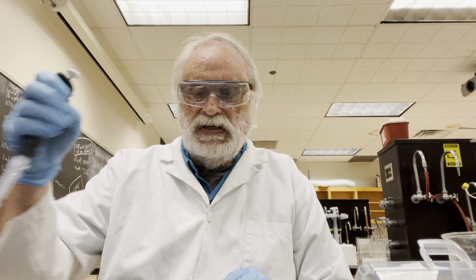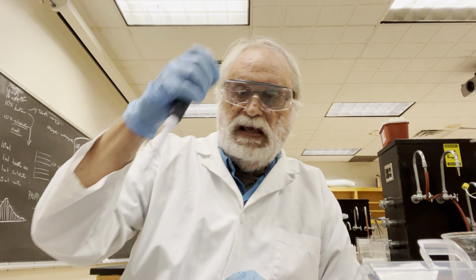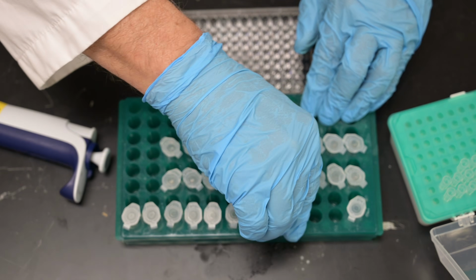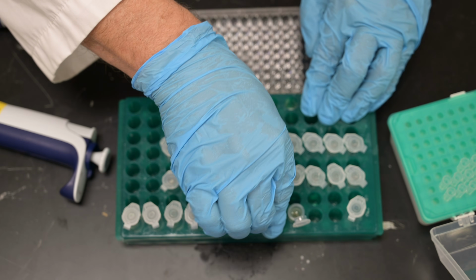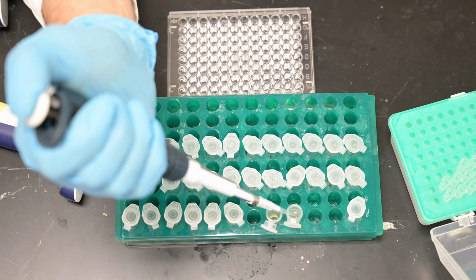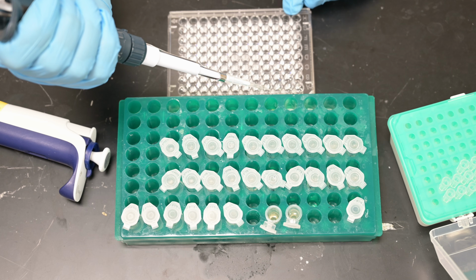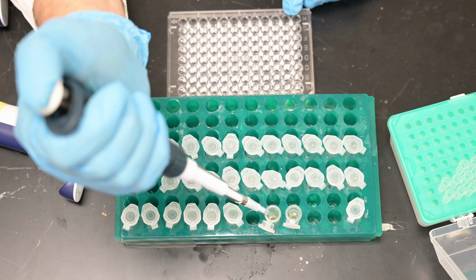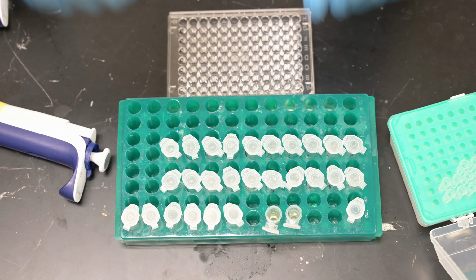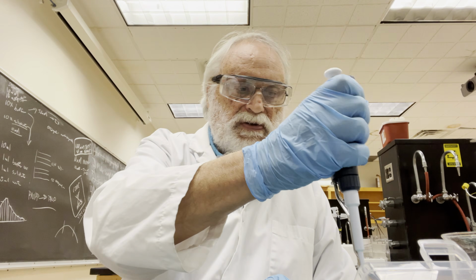The next step is to load our samples onto the plate as well. What I'll do, like I did last time, is open all the tubes on the row that need to be done. The first two samples we have here are the load samples. So load 1 goes into A4, and load 2 goes into A5. So I'll go ahead and close those two samples up. Oops, I don't need to do that.